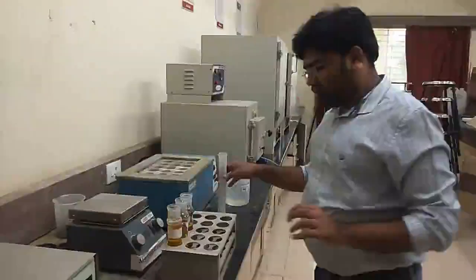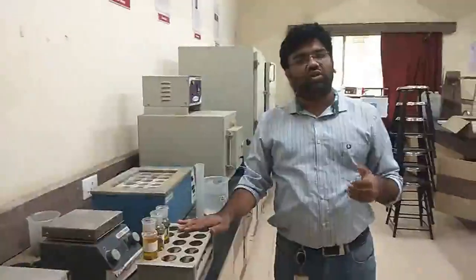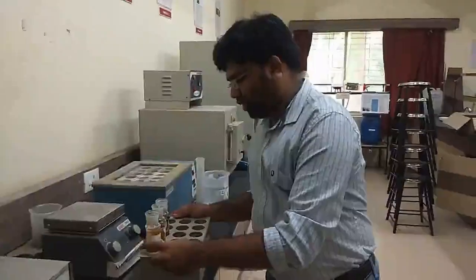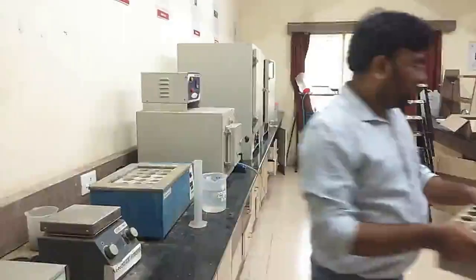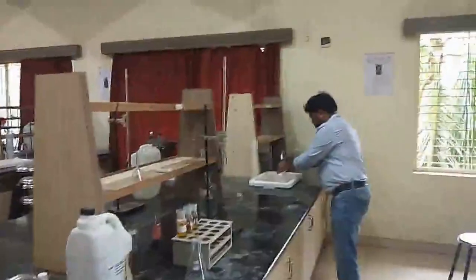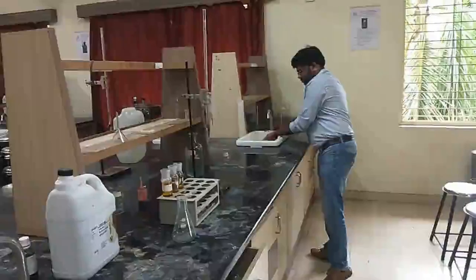So now the next step is to cool this digestion flask properly, bring it to room temperature, and then we do the titration. We are going to empty each of these digestion flasks into a conical flask, so that a better surface area is available for cooling.